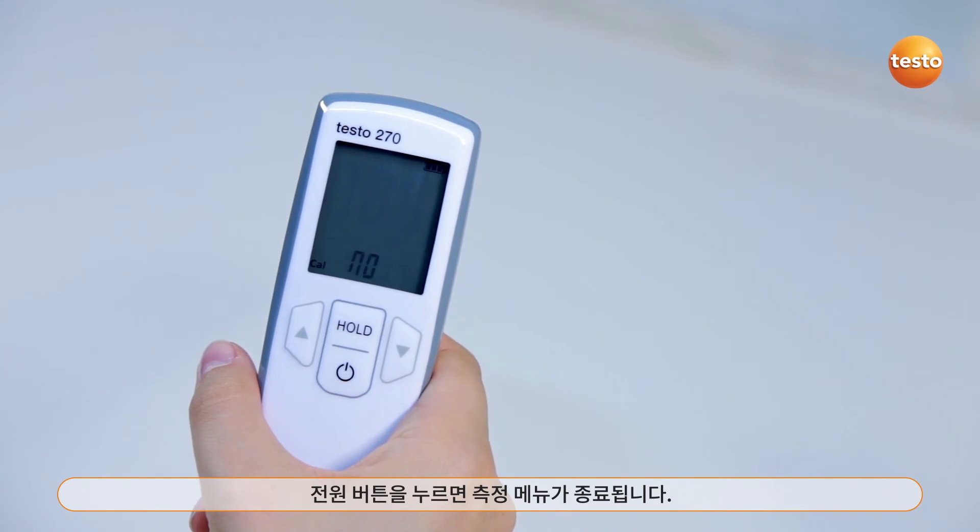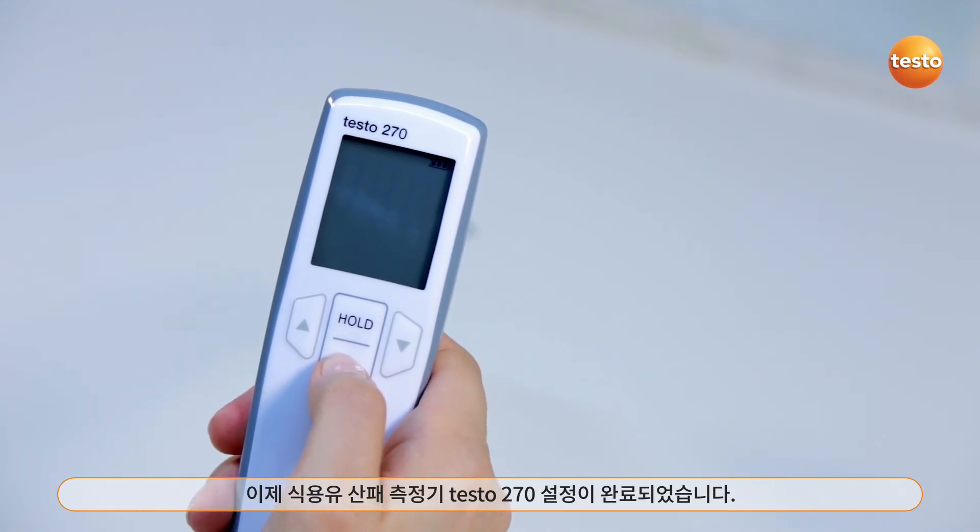I exit the configuration menu with the on-off button and the cooking oil tester is ready for measurement again.